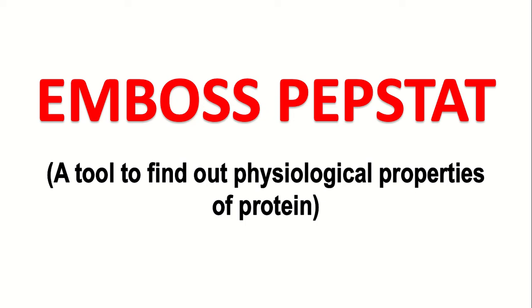Hello guys, in this video I will show you how you can find out the physiological properties of your protein. For this we use a tool called EMBOSS PEPSTAT.